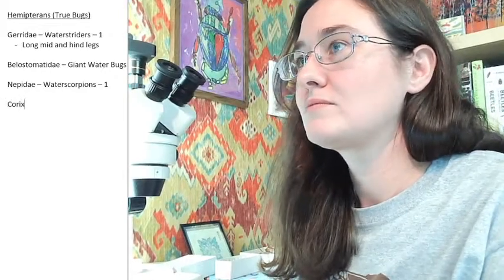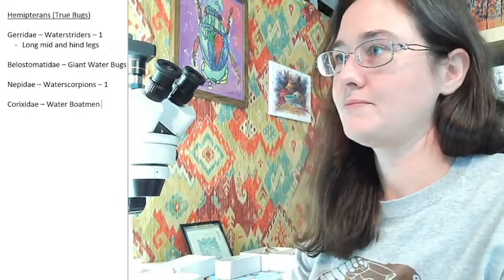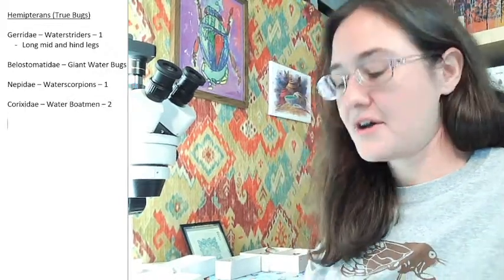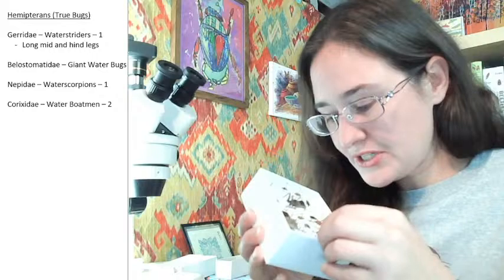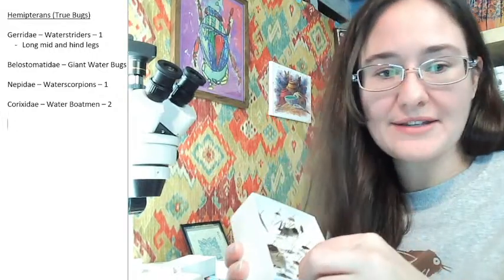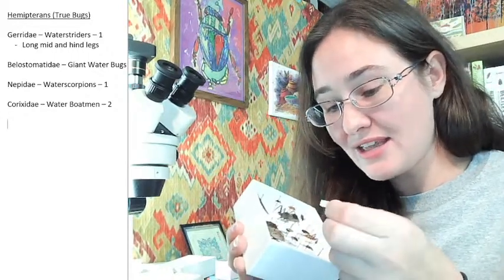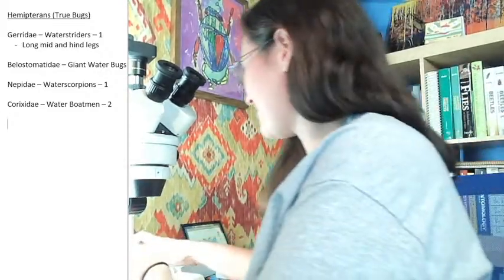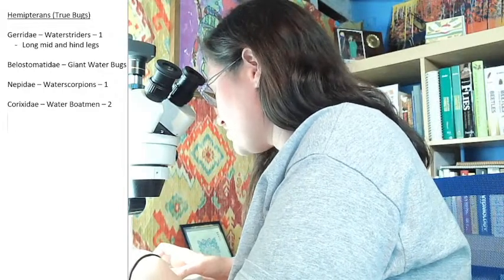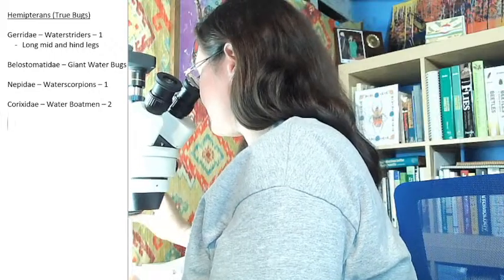These guys are water boatmen. Alright, so I have two different species of water boatmen here. And we're going to be looking at, so there's two different guys, the water boatmen and the back swimmers. People tend to get them mixed up when they're identifying. So, I figured I'd show you the character under the microscope so you would know for sure which one yours is if you ever were IDing.